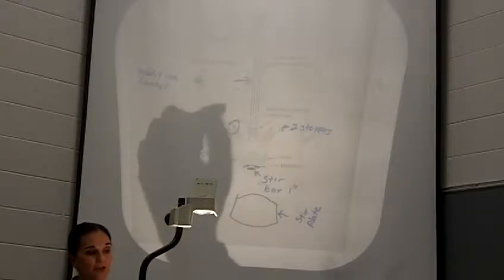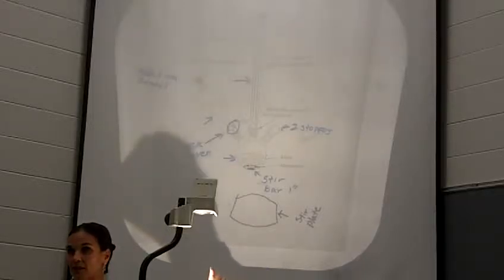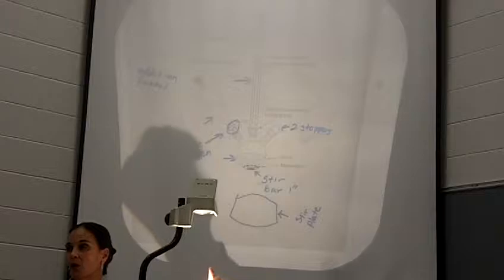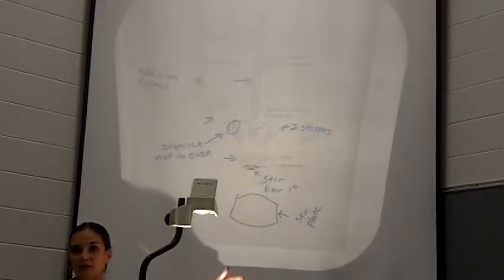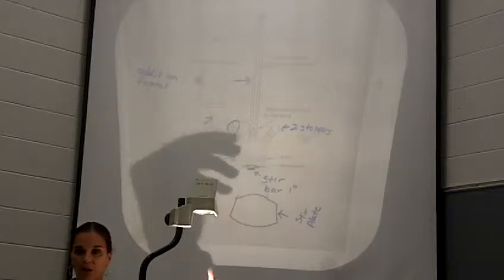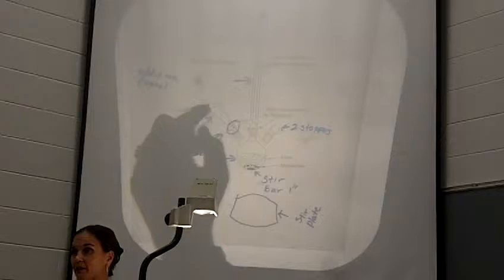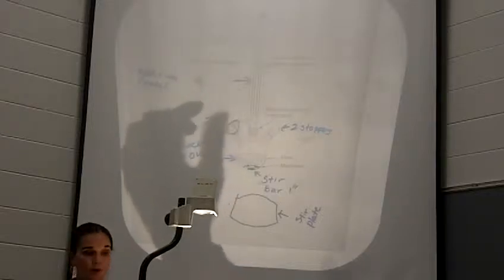Then, in your separatory funnel, you need to have your alkyl bromide solution. So you are going to measure out how much alkyl bromide you need. All the alkyl bromides are liquids, so what should you calculate for how you will measure it? Would a mass be useful or a volume? Volume. So make sure you have volume of your alkyl bromide, okay? And then you need 40 milliliters of the anhydrous dry ether, all right?